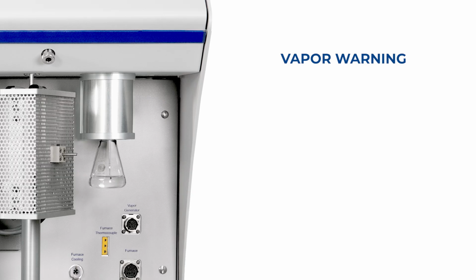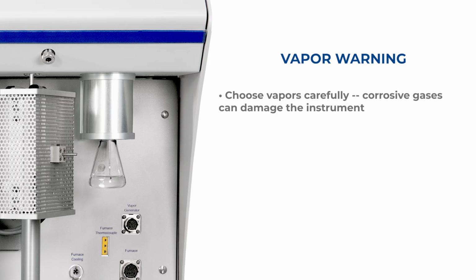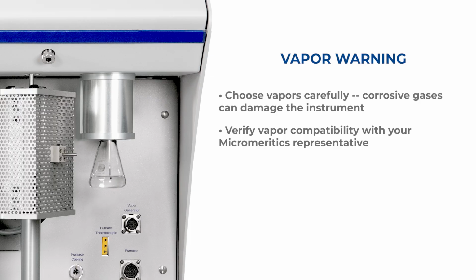Care should be taken in selecting vapors. Corrosive gases will damage the instrument. Make sure to contact your Micromeritics representative to verify the selected vapor will not damage the instrument.